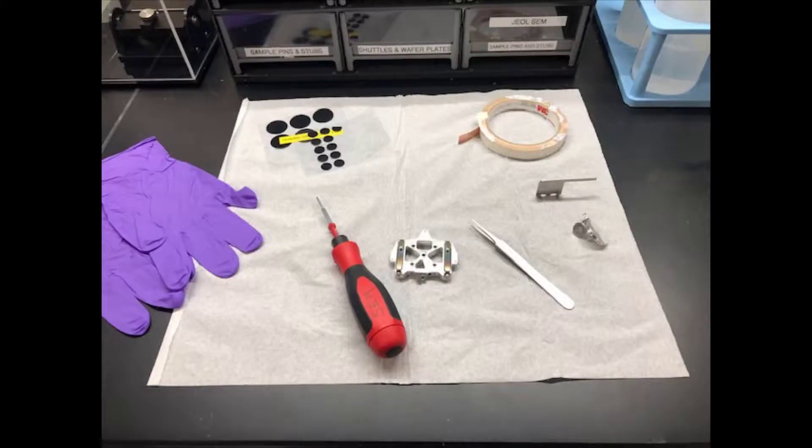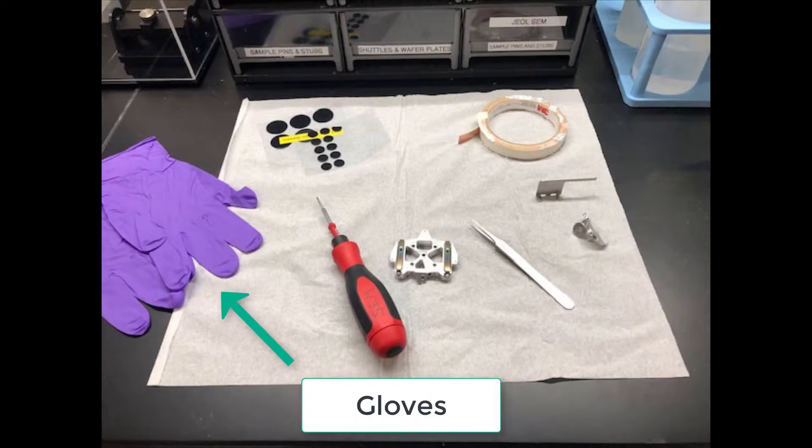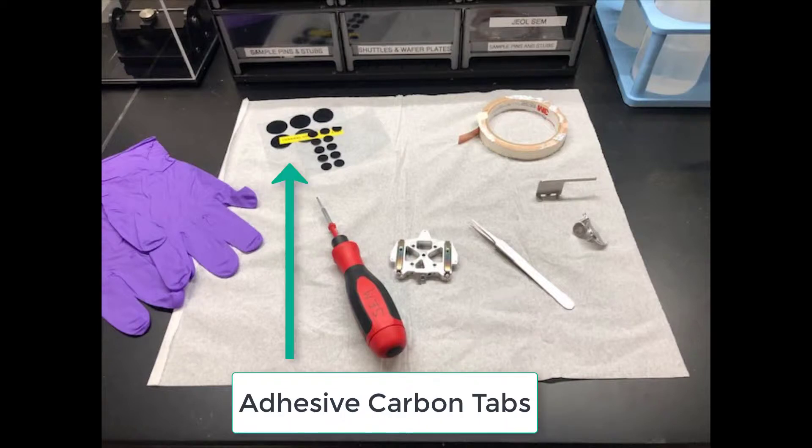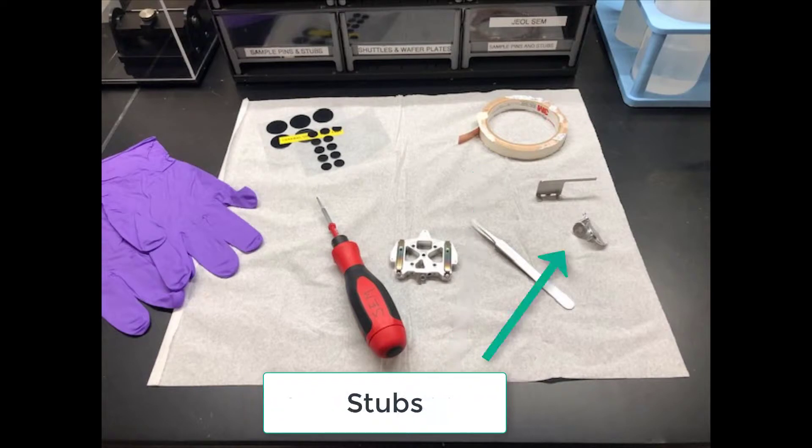Before we begin, let's review the tools needed for sample preparation. You will need to wear gloves any time you are handling the shuttle or doing sample preparation. You will need a screwdriver, tweezers, adhesive carbon tabs or two-sided copper tape, and stubs to affix your sample to.